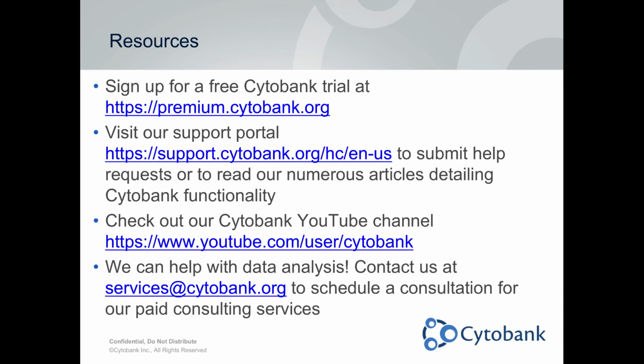By no means are these things done automatically in Cytobank. You need to use these tools in Cytobank or outside Cytobank, but perhaps the sequence is dimension reduction, then downstream clustering based on tSNE, depending on what clustering method you use, and then using a heat map to visualize it later, or calculating MEM score. Of course, there are other tools becoming available to help you with this. One of them we are working on, and we're hoping early next year to have another webinar to introduce it, which can be used to better identify your population based on this pipeline.